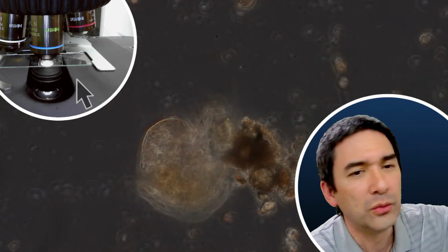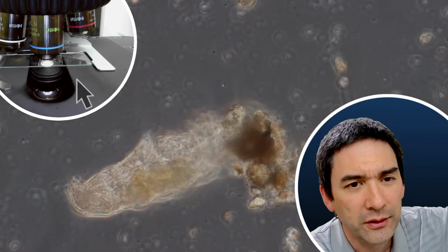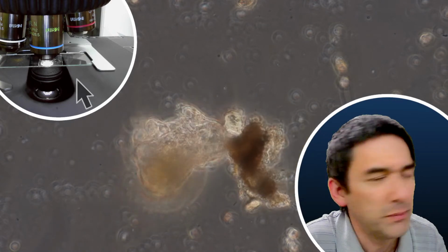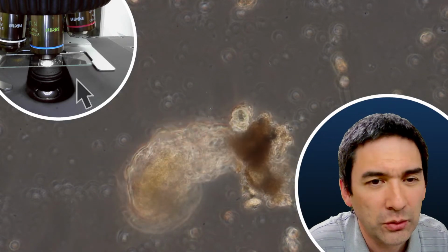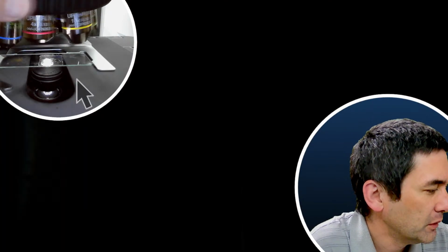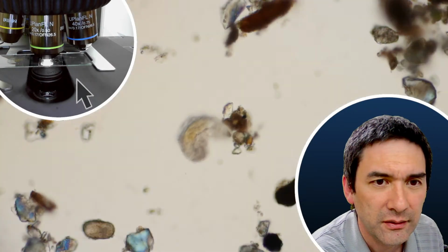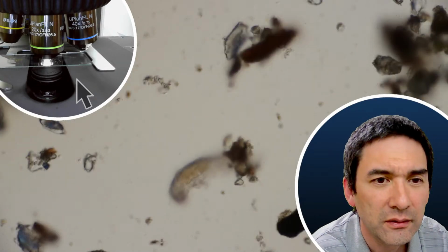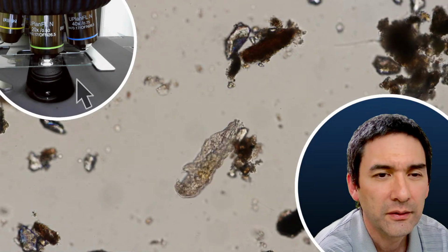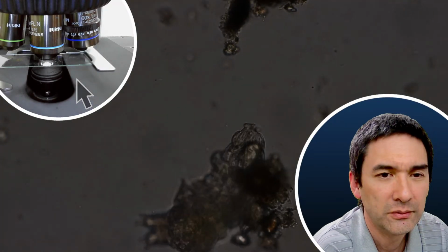It's a little too dark still. I'm now adjusting the camera, making it a little bit brighter here. You see, phase contrast is very good for observing thin objects, but thicker objects like this one over here don't look so good, right? I actually would probably prefer bright field. So let's go back again to bright field, and close the condenser again a little bit to increase the depth of field. Yep, here we go.